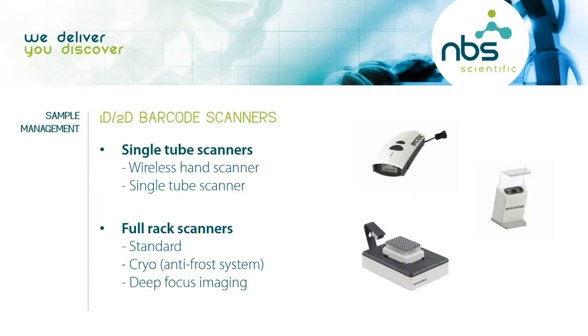All right, so when we have capped our samples, we would like to scan them to see the barcodes, of course, and to store the barcodes, so we will know which sample is located in which tube. For that, we can use 1D or 2D barcode scanners, and there are some possibilities. There is a single tube scanner and a full rack scanner. As you see on the right hand side, there are some different options.